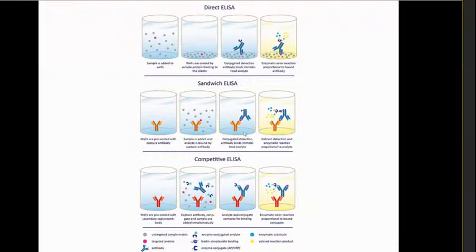After that binding, we add the secondary antibody. The secondary antibody helps us recognize the antigen, specific only for the antigen. If there is an antigen, it binds at the particular portion. After that, we do the wash. If the interaction happened, meaning the antigen-antibody and the enzyme linked antibody are there, it gives the expression for the substrate. So only then does the final yellow color happen.